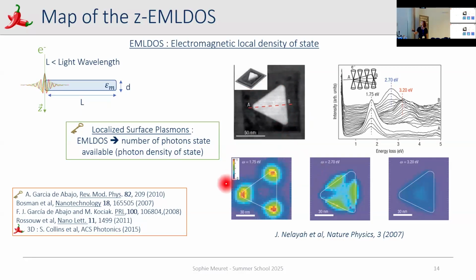You can see here the dipolar mode, here the second and the bulk mode, whispering mode, I think that's the last one. So that's the first experimental paper looking at plasmon and mapping the MLDOS at the nanoscale using electrons. Since then, this is 2007, there was a lot of activity. I put a few here, but of course, this is a booming field. A lot of people are using it just to characterize their nanoparticle now. This is done on a daily basis in a lot of electron microscopes.